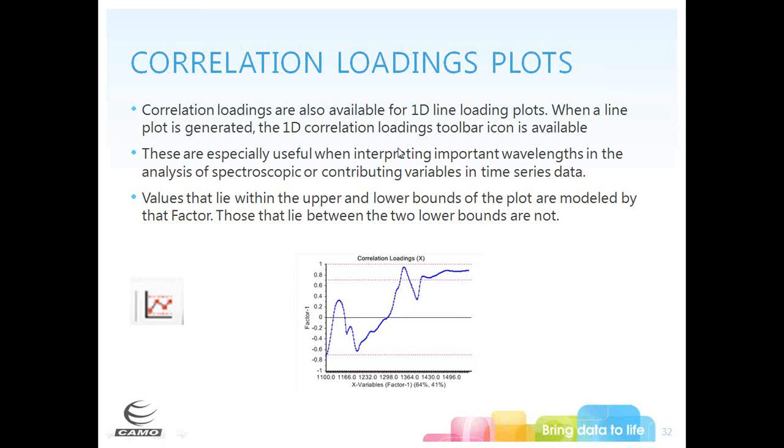And we do have now the 2D loadings plot, which is good when we have smaller data sets, but when we get into instrumental data, it is more helpful visually to see our loadings as a line plot so that they're depicted as our data themselves are, resembling a spectrum or a chromatogram.